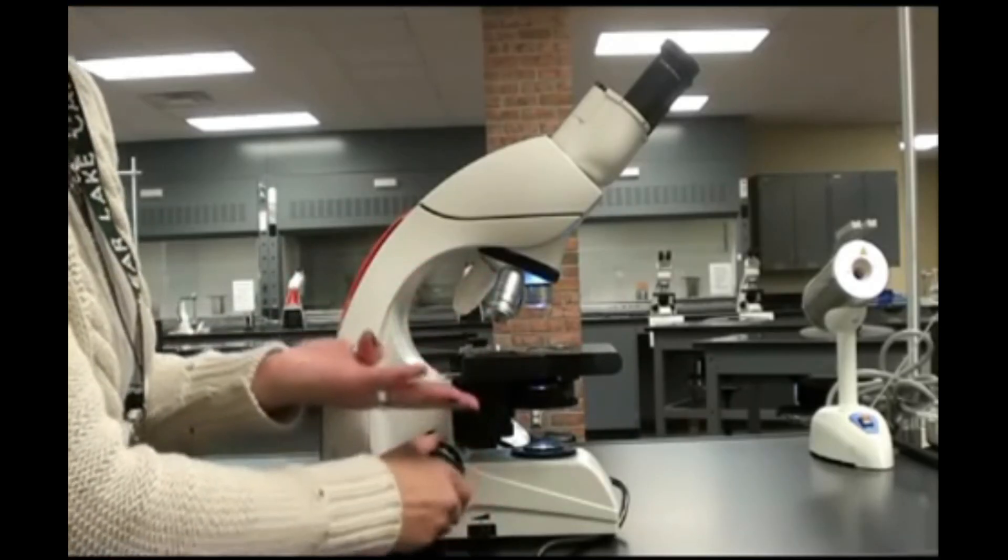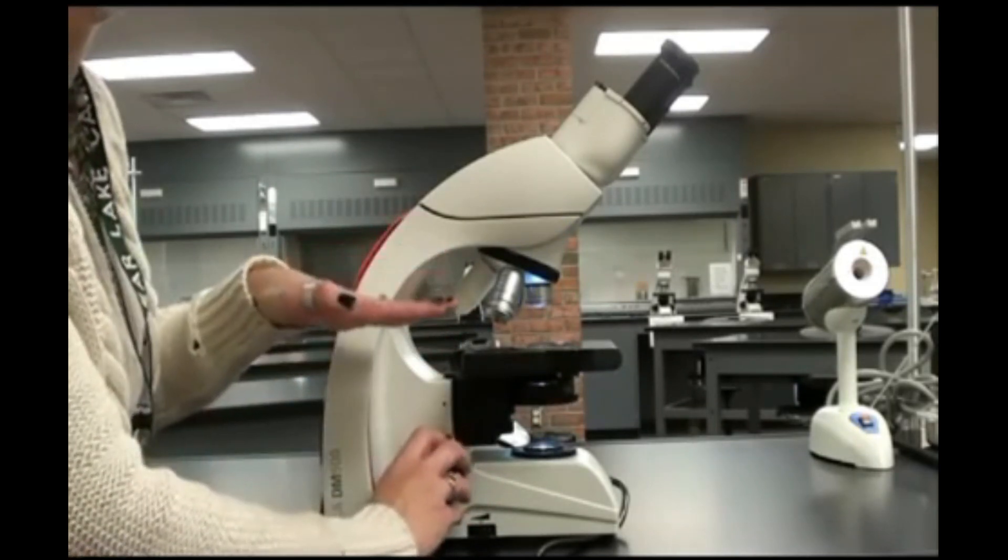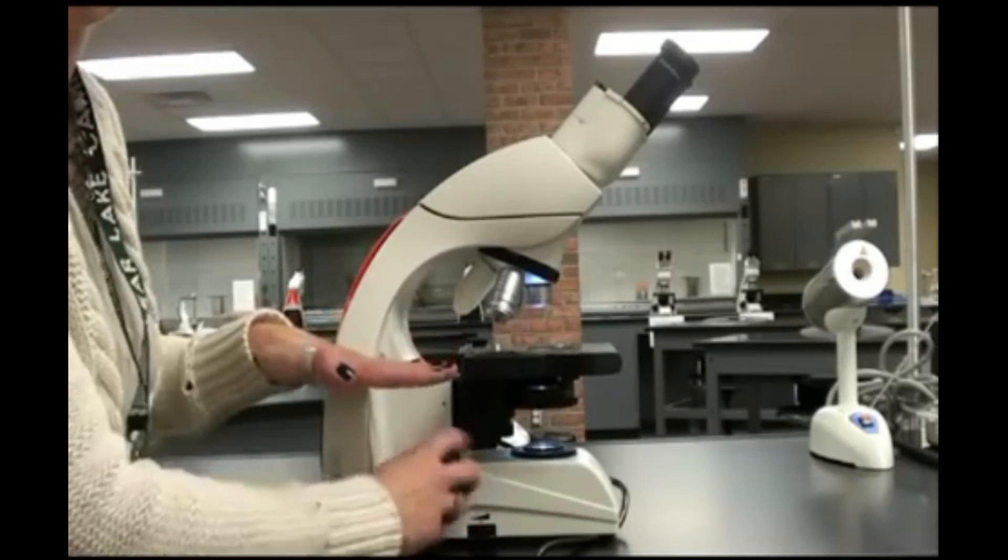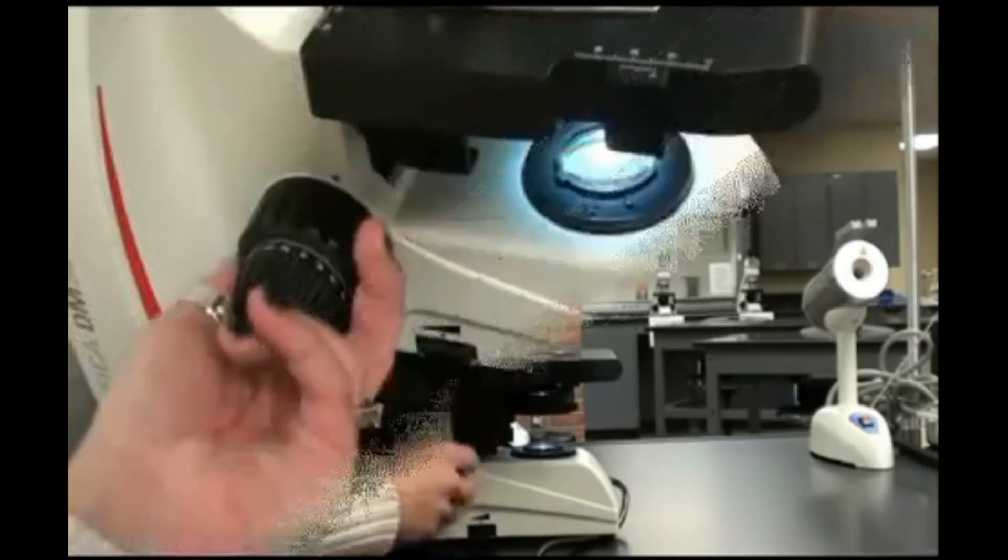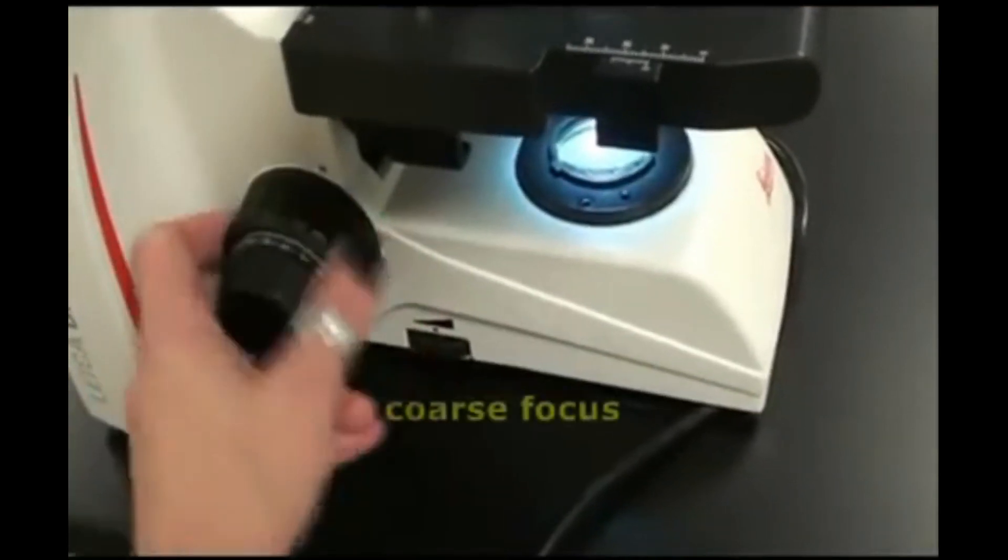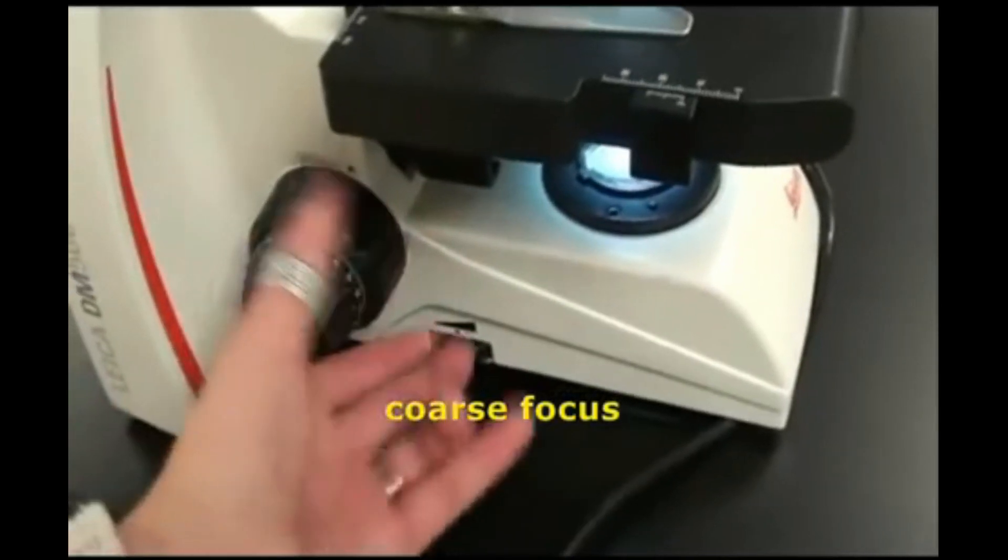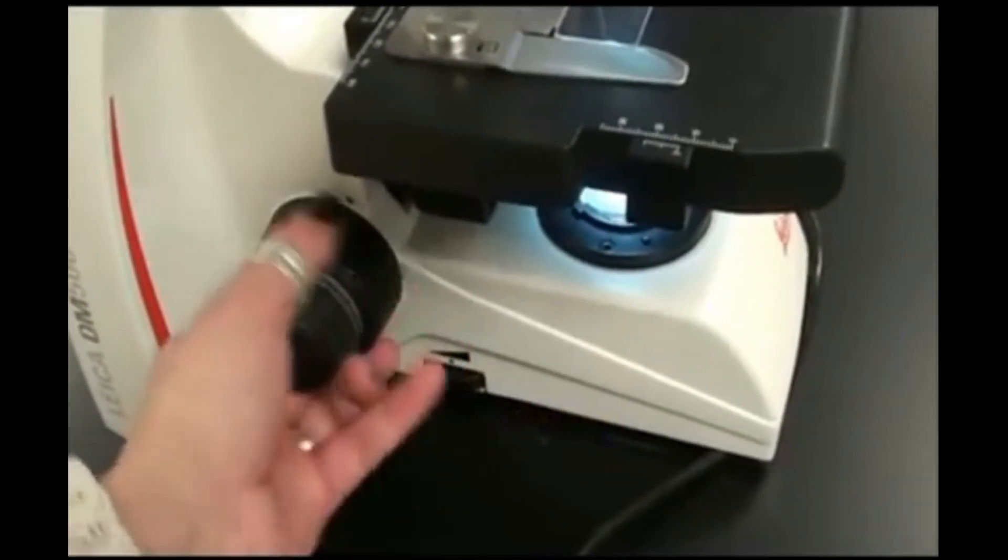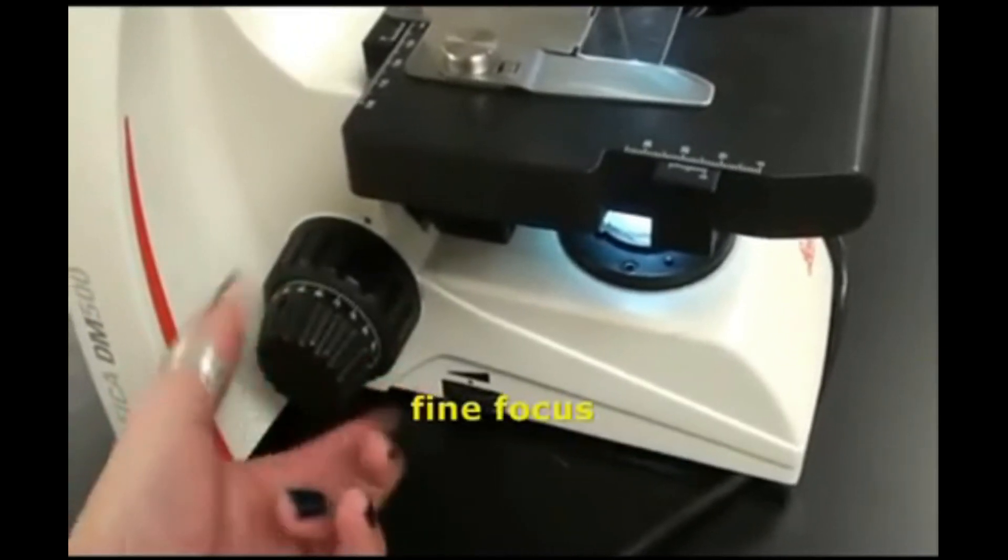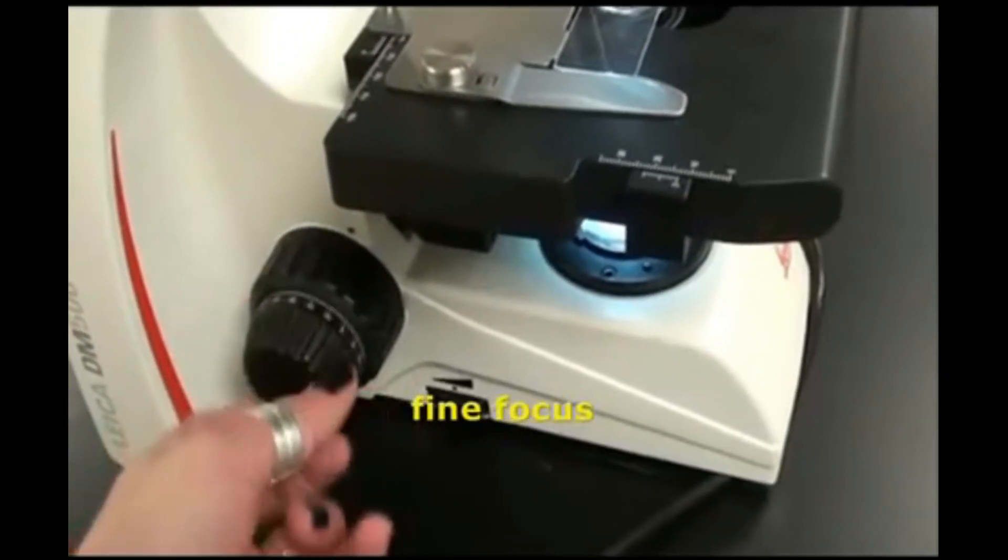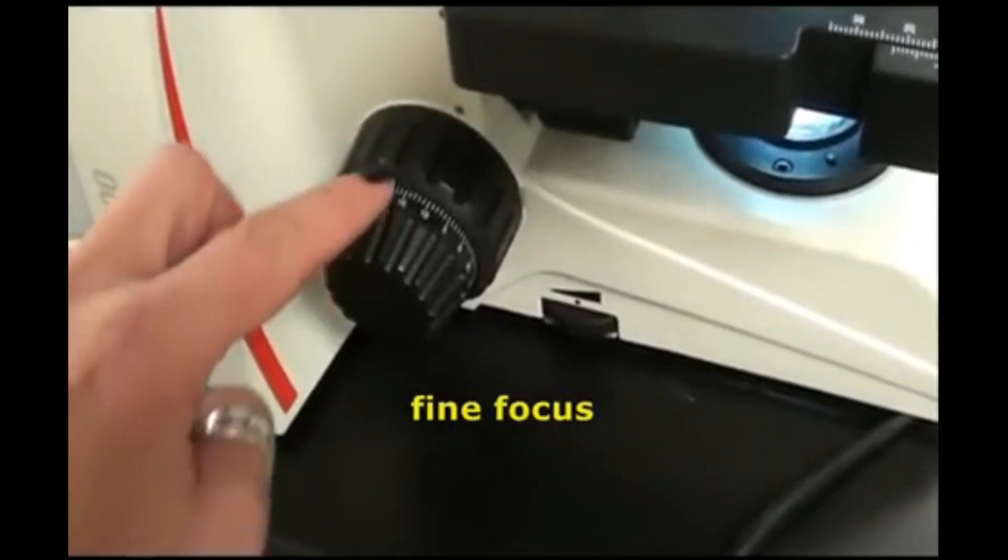The focus knobs raise and lower your stage and the vertical position of your specimen is what determines whether it is in focus or not. On this scope, the coarse focus can be adjusted by turning the part of the knob that's closest to the body of the scope. The fine focus can be adjusted by manipulating the outer portion of this knob, doing so fine-tunes the image of my specimen.